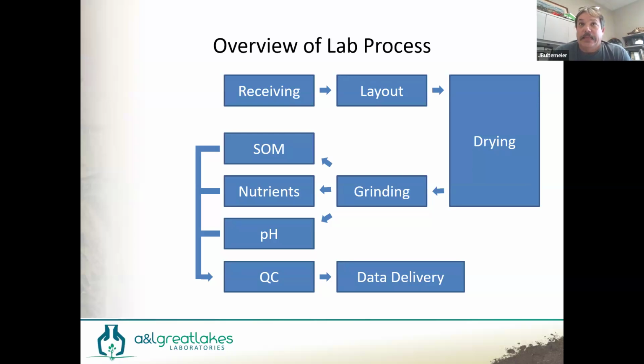And then once that's approved, it'll actually go through a couple of steps where my staff looks at it as well. Does it make sense for the region? And then we send this report out to the client. That could be an electronic data file to our large ag customers. That could be a PDF report to any of your staff. It could be a PDF report to the homeowner. And so that's sort of the big process, but let's get into the steps a little bit better.